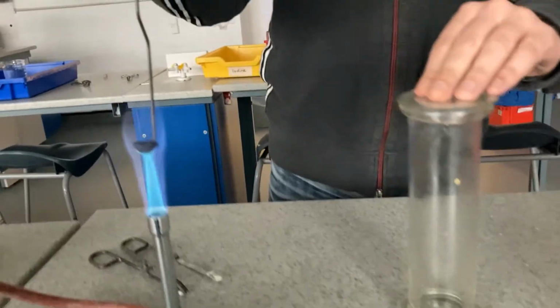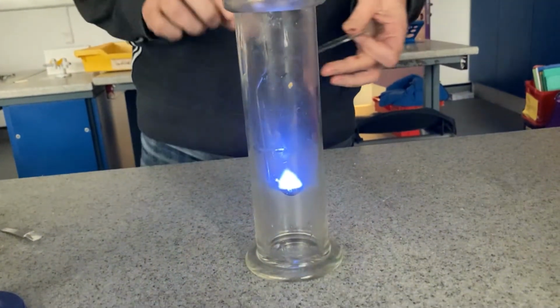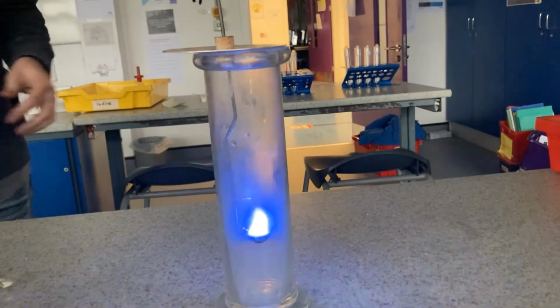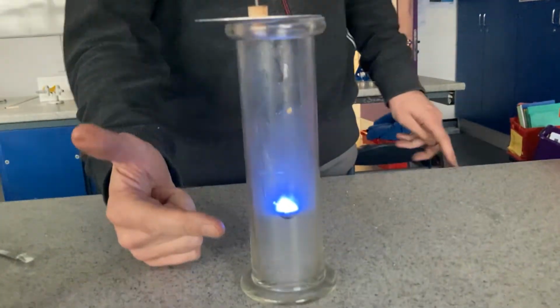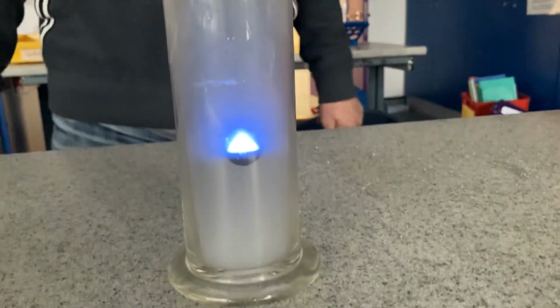Can you see? Oh, it's got a little blue flame. Little blue flame. Oh, isn't that nice? And you can see that the sulfur also burns really, really well in the oxygen. Makes sulfur dioxide. It's really poisonous. Definitely leaving that aside for a while.